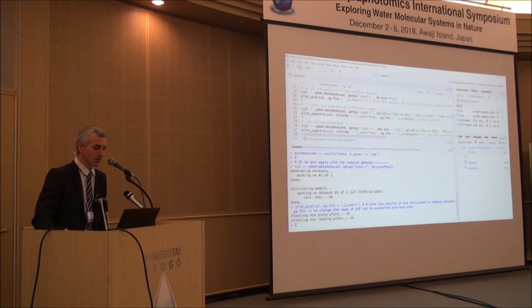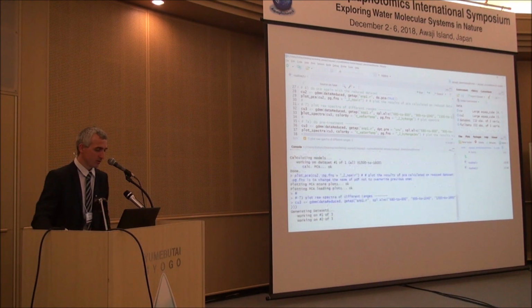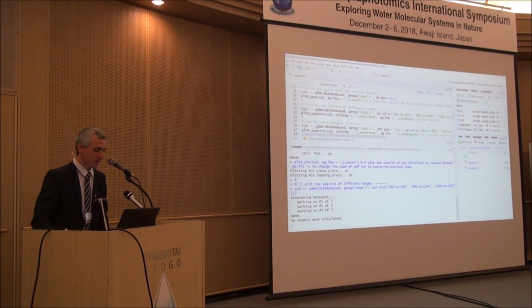You just list in the analysis procedure list or in this code what ranges you want to use for analysis. You run the same code, and then you see a message came up with 3 subgroups of your data set.